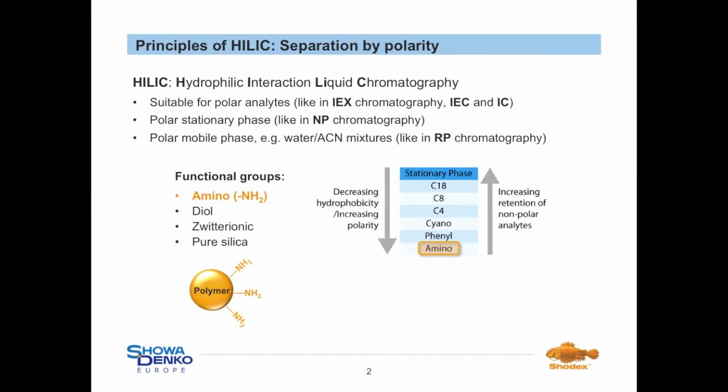When we take a look at the amino functionality, the retention of non-polar analytes decreases, whereas the retention of polar analytes increases. This is caused by the increasing polarity of the stationary phase by amino functionalization.